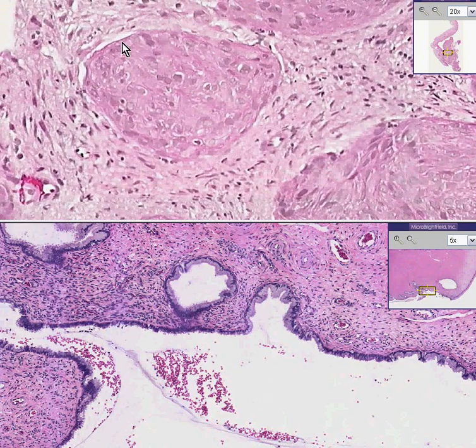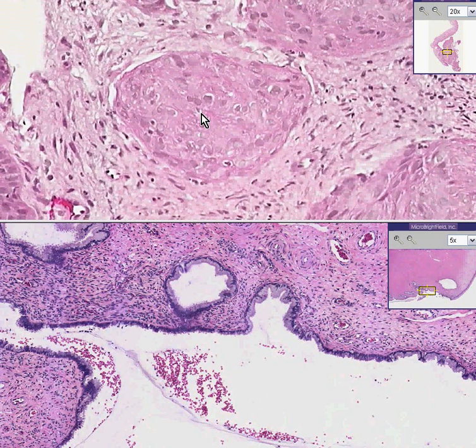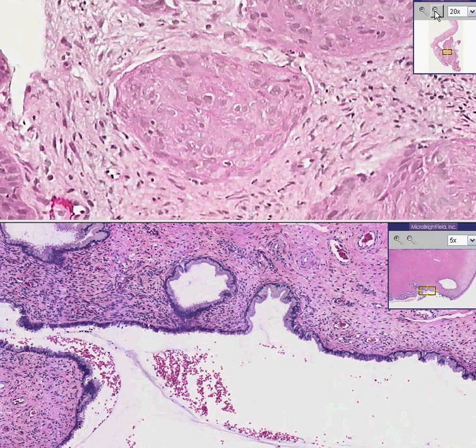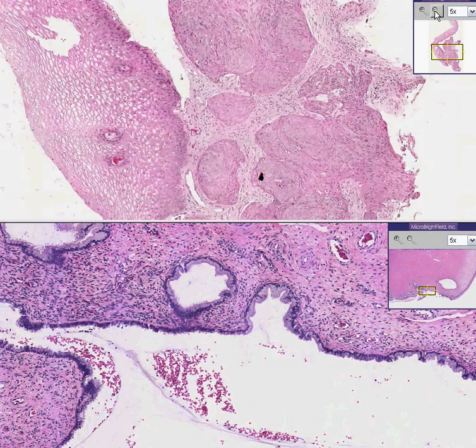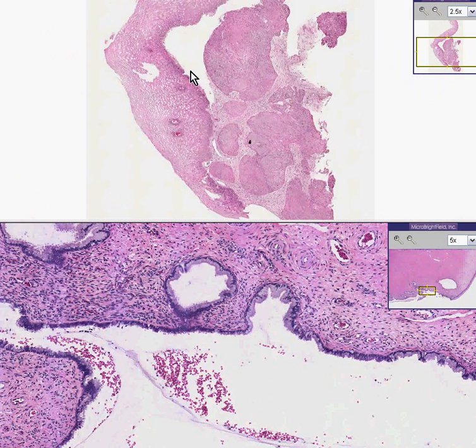You know they don't look terribly bizarre by way of pleomorphism, but you know that they're completely infiltrated by fibrous tissue. So this is not squamous metaplasia. This is infiltrating squamous cell carcinoma. And this is a cervix biopsy. Thank you very much.